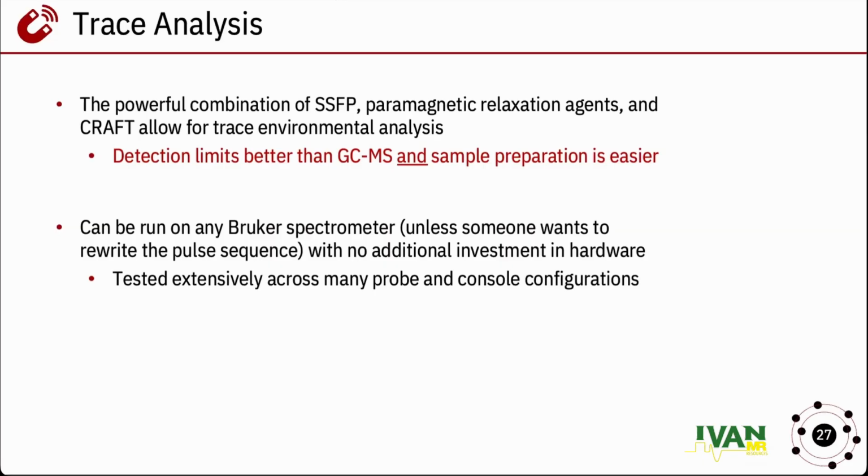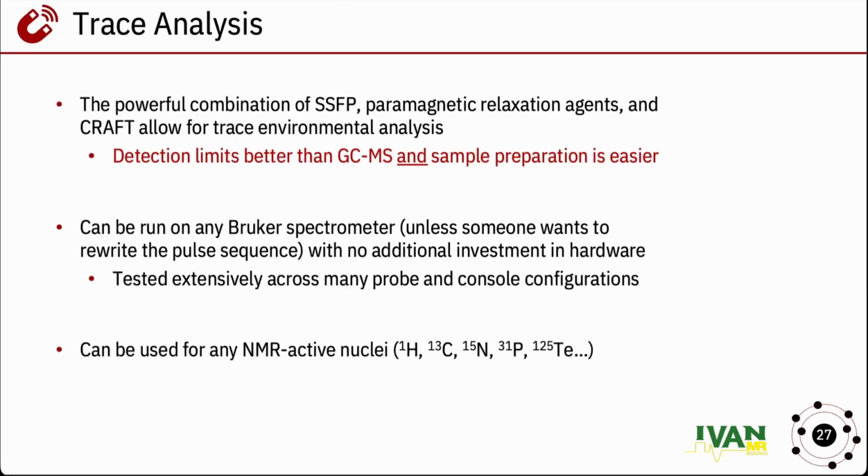And I'll point out that you're getting the signal to noise improvement equal to or greater than installing a cryoprobe with no actual investment in your NMR hardware. So it's really, really powerful. And I've tested it across a whole bunch of probe and console configurations, a whole bunch of generations, different types of probes. It's worked very well on all of them.